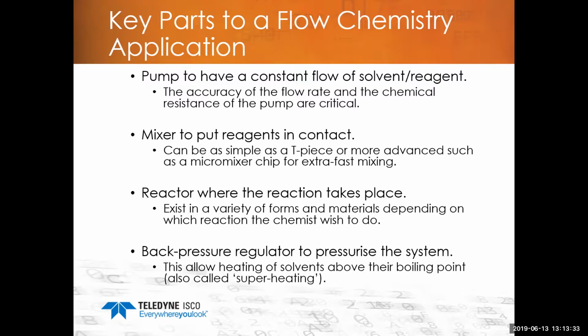You need a reactor where the action takes place, which can be part of the mixer, so to speak, in different forms and types of materials. And then many times you want to use a back pressure regulator to pressurize the system. But the key piece we're going to talk about today is the pump, and we want to get into that a little bit.